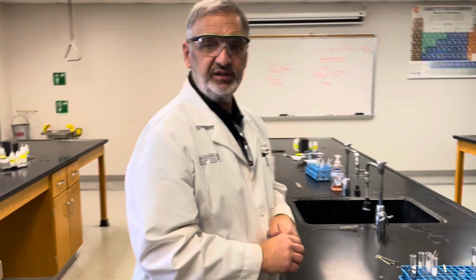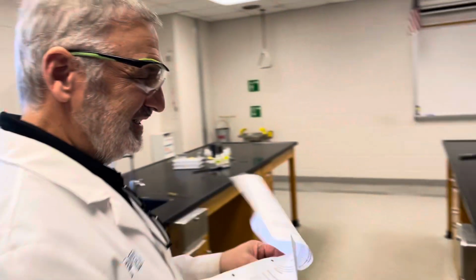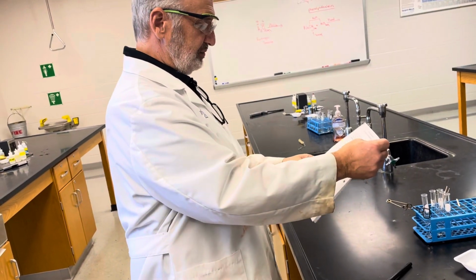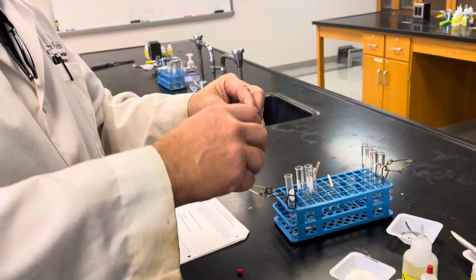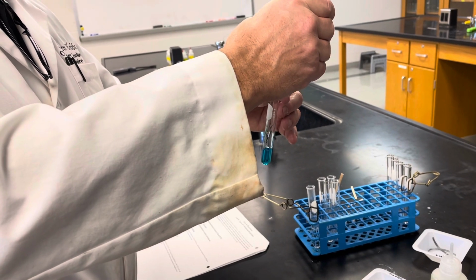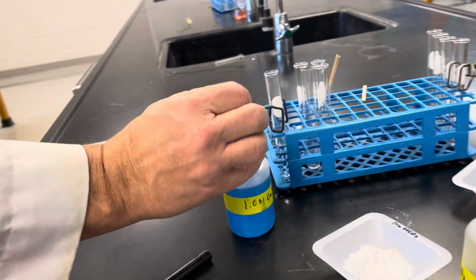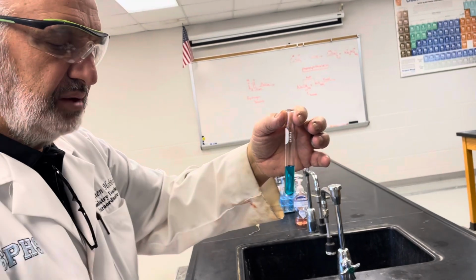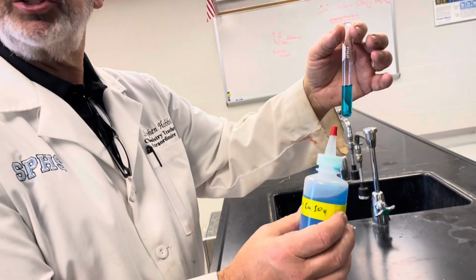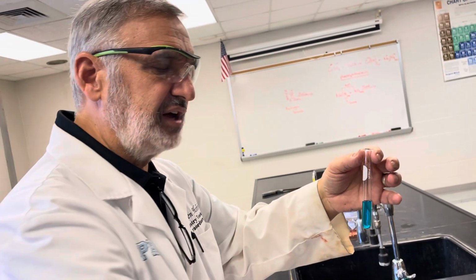The third reaction is, let me get my sheet. I thought I could have it memorized. The third reaction is we want to use copper sulfate. Notice the deep blue color of the copper sulfate. Now again, this is an aqueous solution. This is not pure copper sulfate, which is a solid. Ionic compounds are solid at room temperature, so the only way to get them to react is to dissolve them into water.